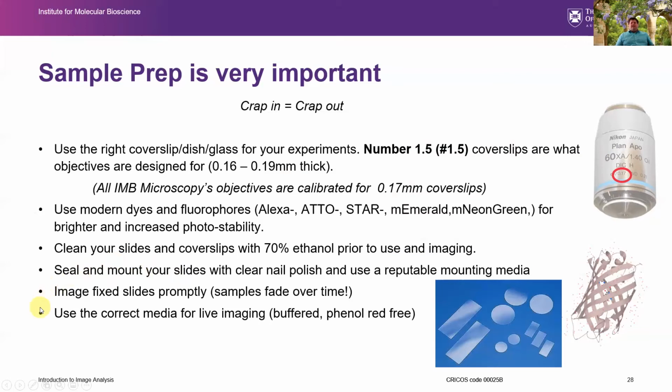Imaging fixed slides should be done pretty promptly. They fade over time, and depending on the mounting media you've used, it may or may not contain preservatives, and then your dye or label might have just faded, and you can't know for sure that your treatment made a difference unless you've got the right controls as well.